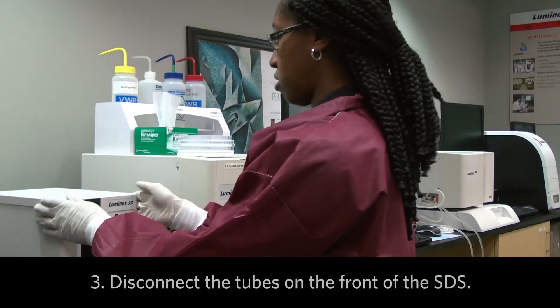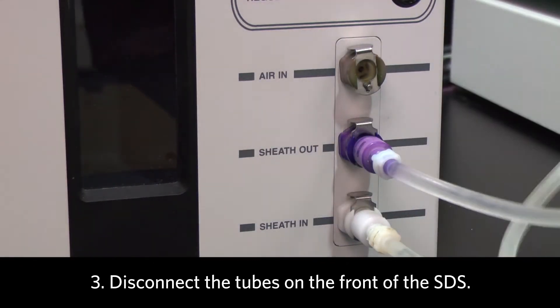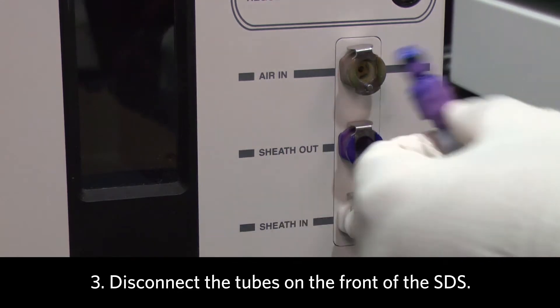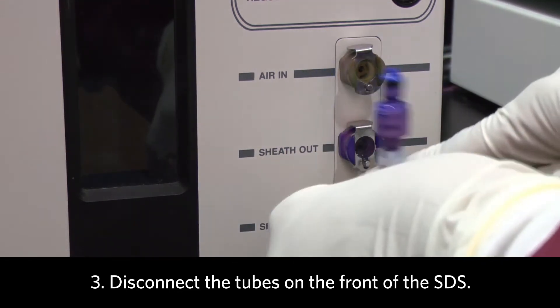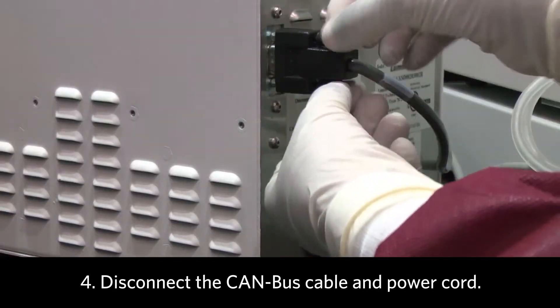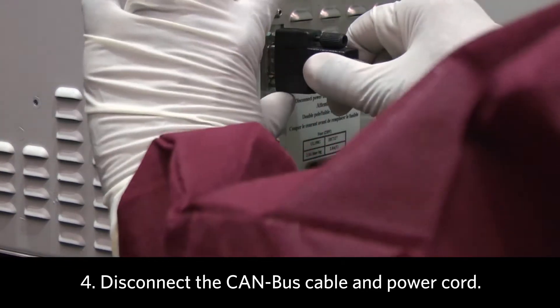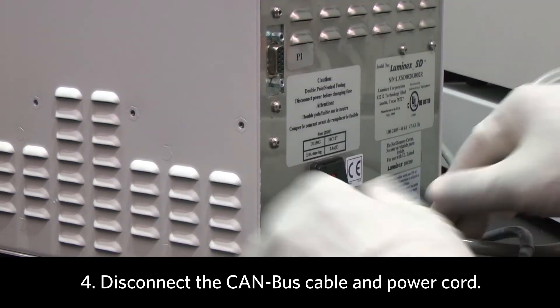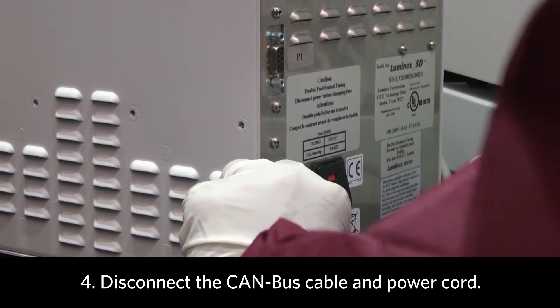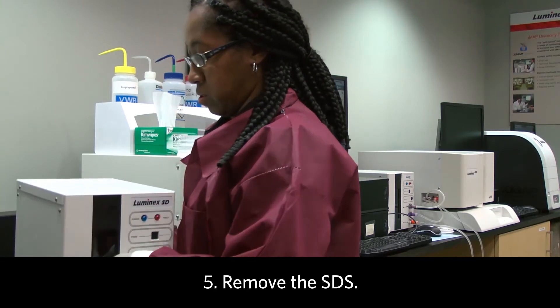Next, you want to disconnect the sheath tubing from the SDS. Also, disconnect the CAN bus cable from the SDS and the power cord. Then move the SDS to a safe place.